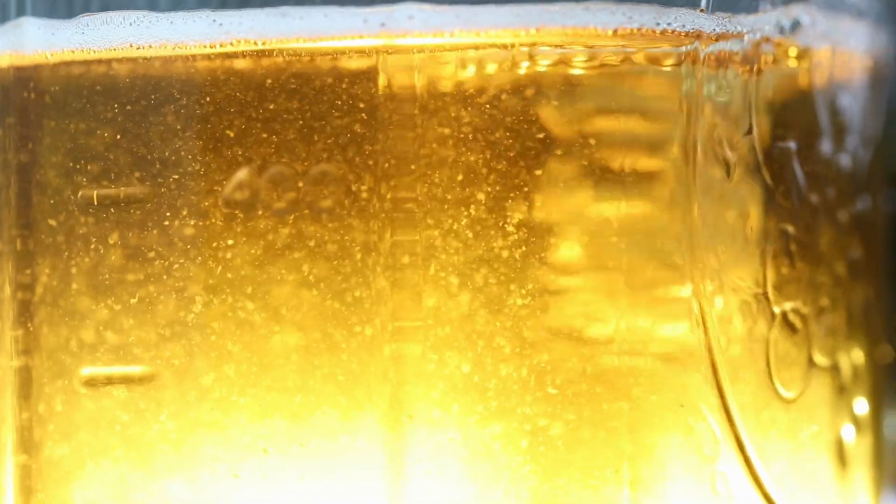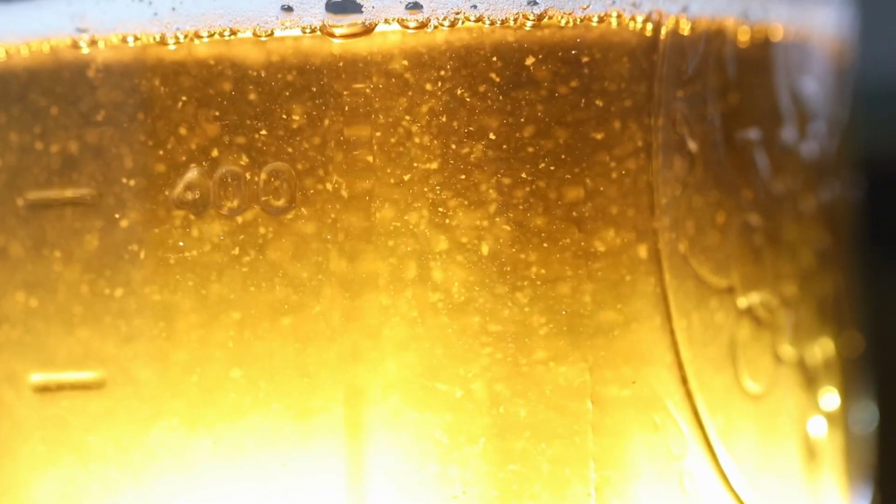Hey y'all, today I want to talk to you guys about making liquid culture from agar. To me, this is the easiest way to do it. It's called a needle biopsy, and you can do this from either slant or an agar dish.